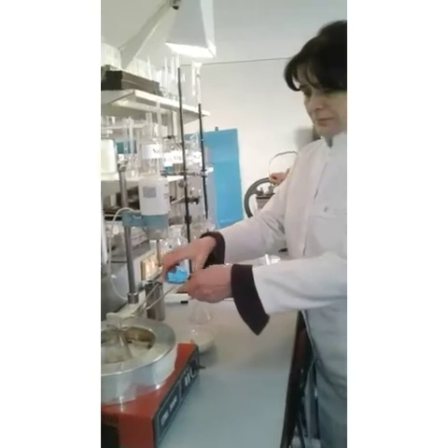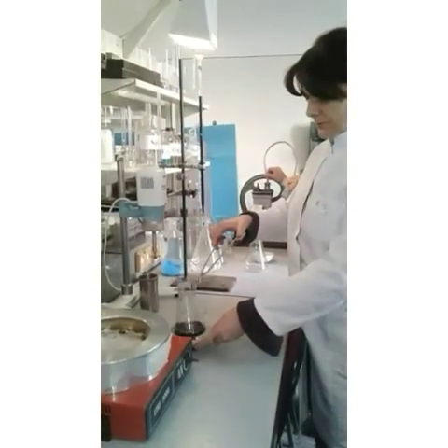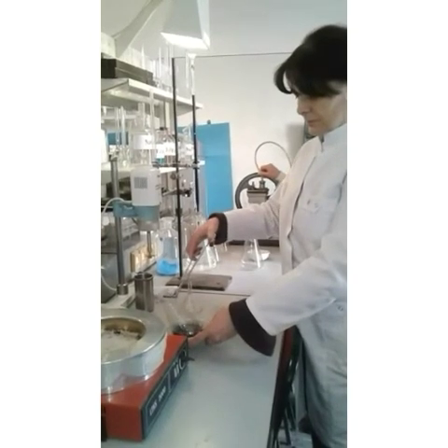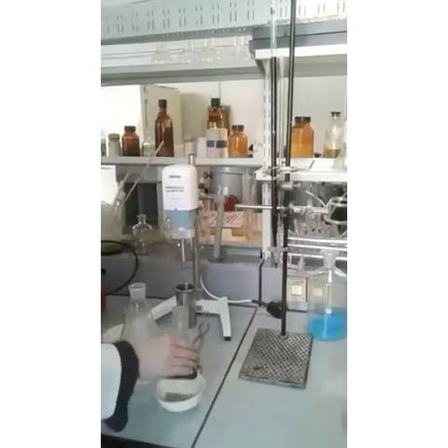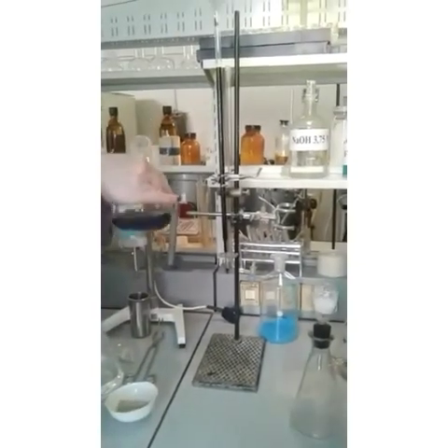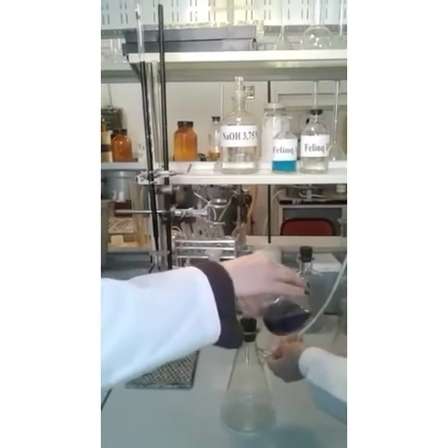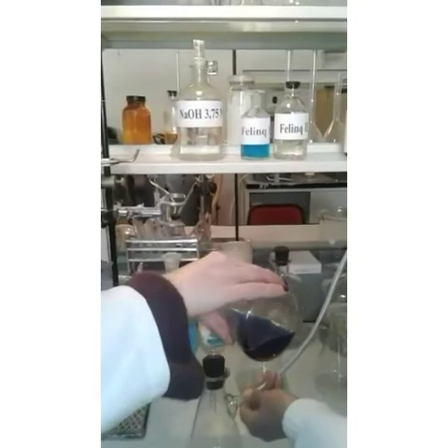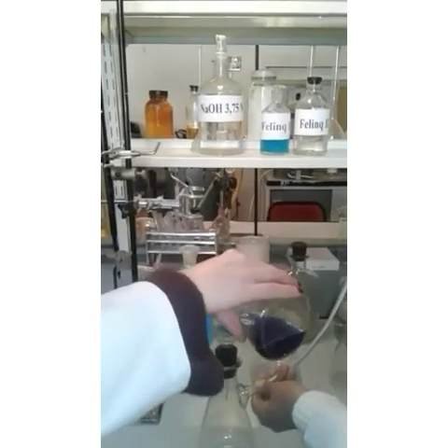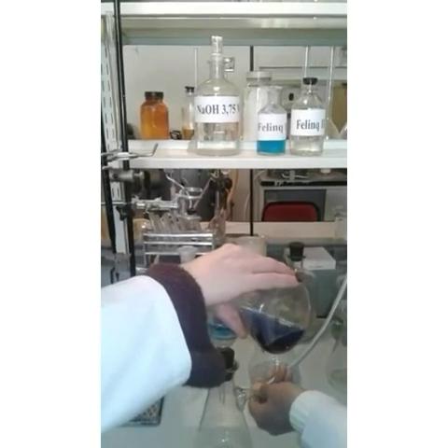We remove the flask from heating and set it in an inclined position for better sedimentation of cuprous oxide. The liquid is drained from the sediment through glass filters with fibrous asbestos inserted into a Bunsen flask. This flask is connected with a Komovsky pump.